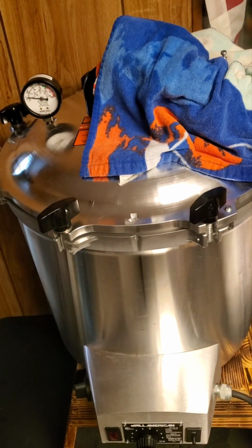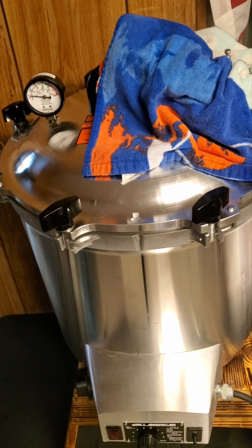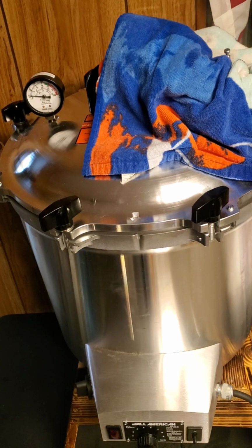Go ahead and get the positive pressure tent on. Move the guitar out of the way. We were jamming on that a little bit ago. Takes a while to get warmed up and get everything set up and going, but cooling it down and getting it out is pretty quick.